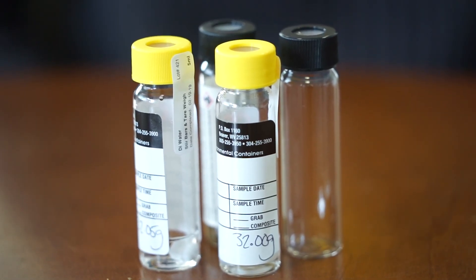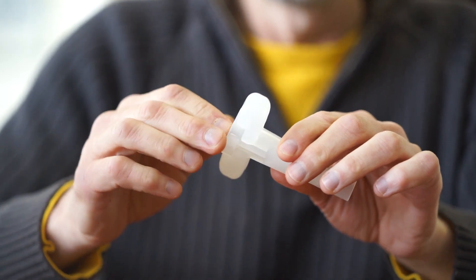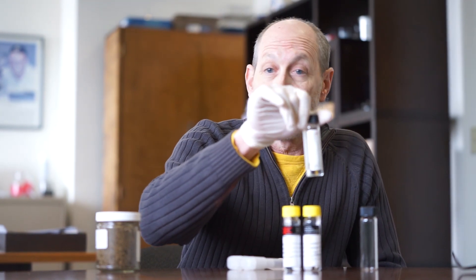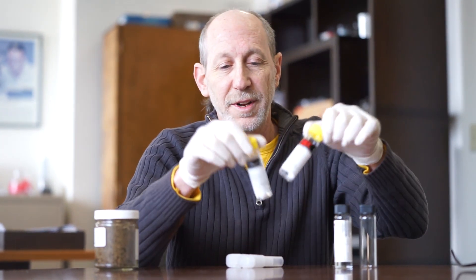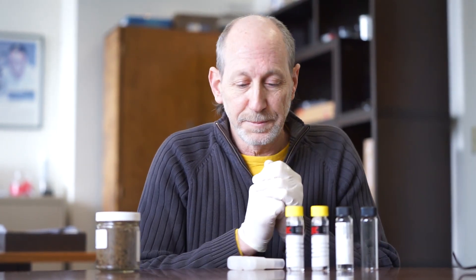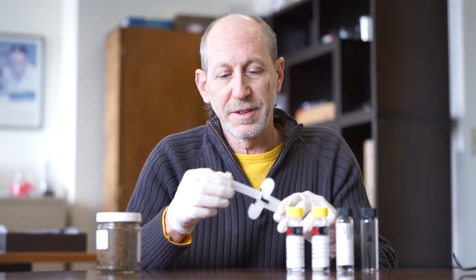This is what you will receive in the field. It's a four vial set with a two-piece TerraCore sampler. Each of these vials represents something that we need. You have an empty vial, a vial that has 10 milliliters of methanol in it, and two vials that have 5 milliliters of deionized water and a stir bar in it, and this two-piece plastic TerraCore set.